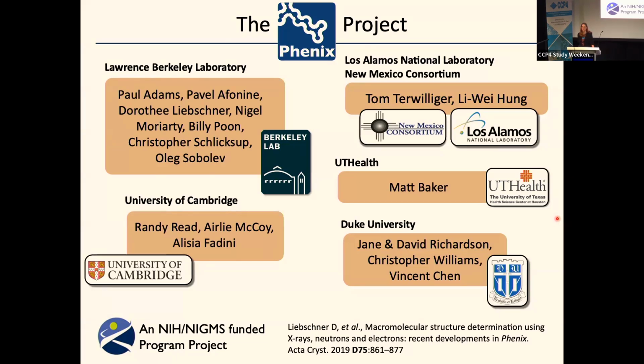Robert from Astex. Yeah, so confidence measures. Without sounding flippant, maybe there should be a confidence measure of the confidence measures, such as the depth of the MSA, or how many iterations AlphaFold has been using. If it's not the default, maybe something the community could ask the developers of AlphaFold or OpenFold to provide as guidance for confidence measures, how much we can trust them.